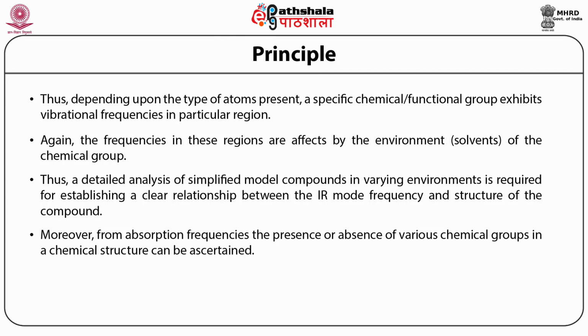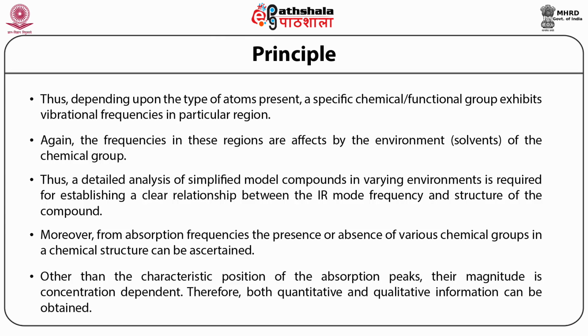Moreover, from absorption frequencies, the presence or absence of various chemical groups in a chemical structure can be ascertained. Other than the characteristic position of the absorption peaks, their magnitude is concentration dependent. Therefore, both quantitative and qualitative information can be obtained.